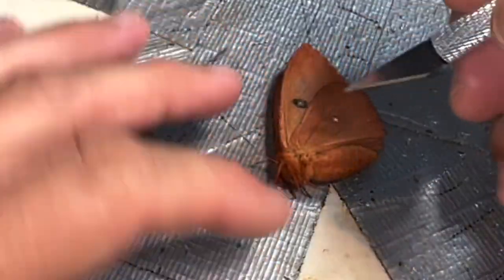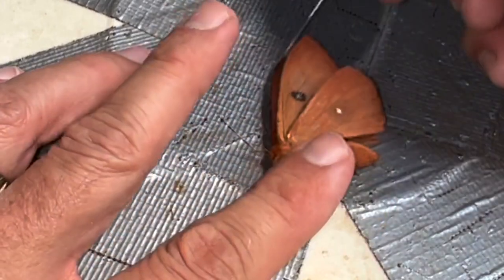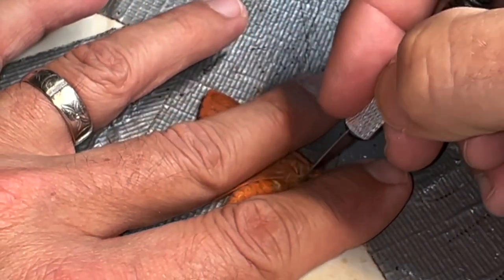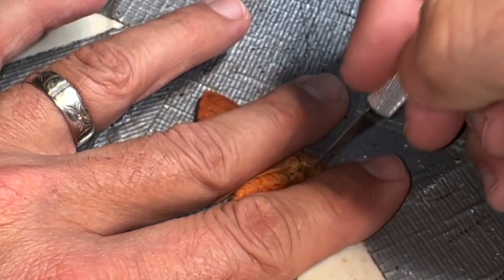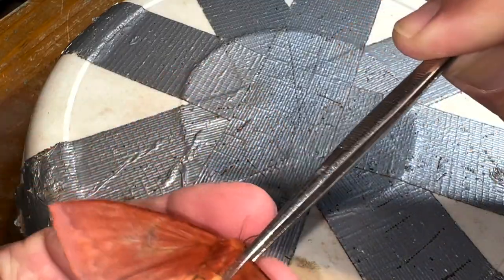One thing I'm going to do is use my X-Acto knife and sever the tendons on the wings. Underneath the hind wing and forewing on the left side, flip her over, underneath the hind wing and the forewing on the right side. This specimen is now very pliable because those tendons have been severed.